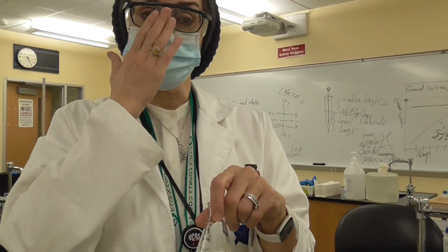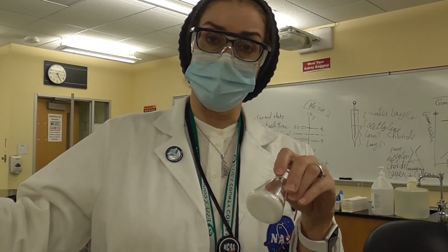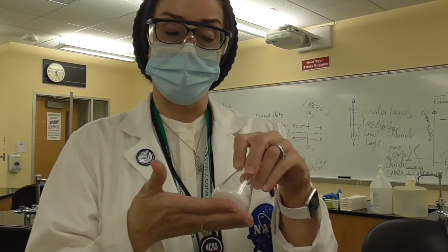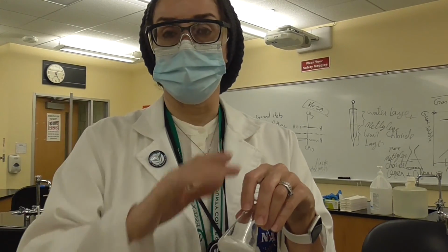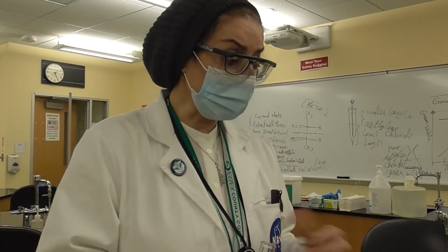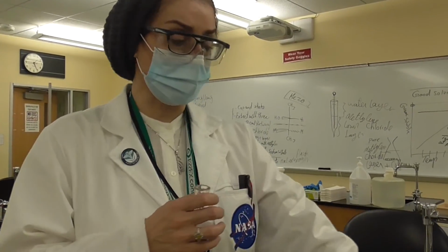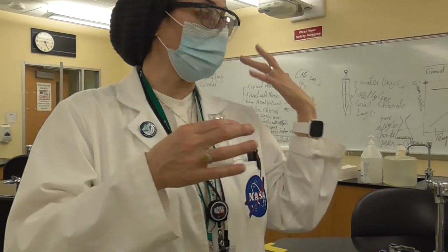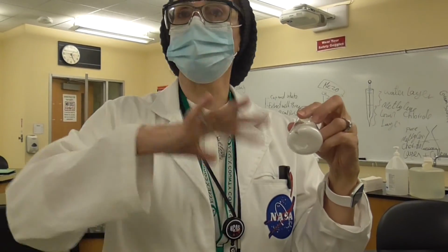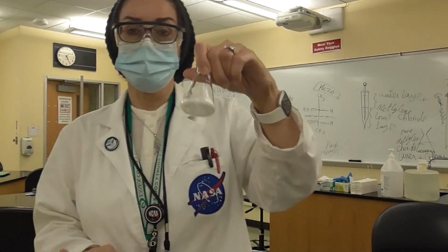That we weighed. Now we are going to calculate the percent error from whatever you weighed, after you weigh it, divided by the actual, the initial, and you will be able to get the percent. We will see how much we lost through transferring from one container to the other. So that's a very good idea, to see how many percent of human error or transferability or anything like that. So we're done for today.